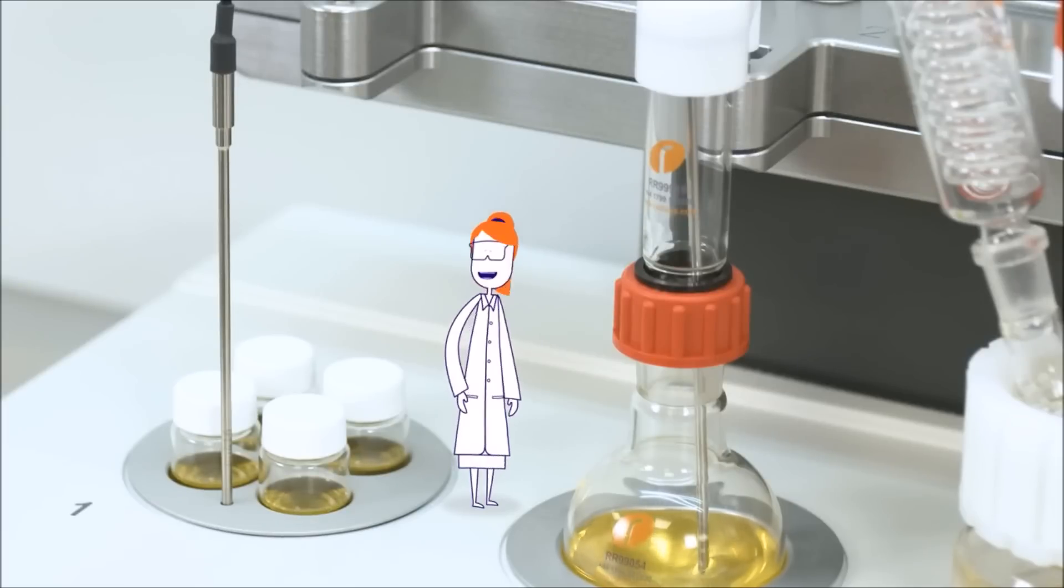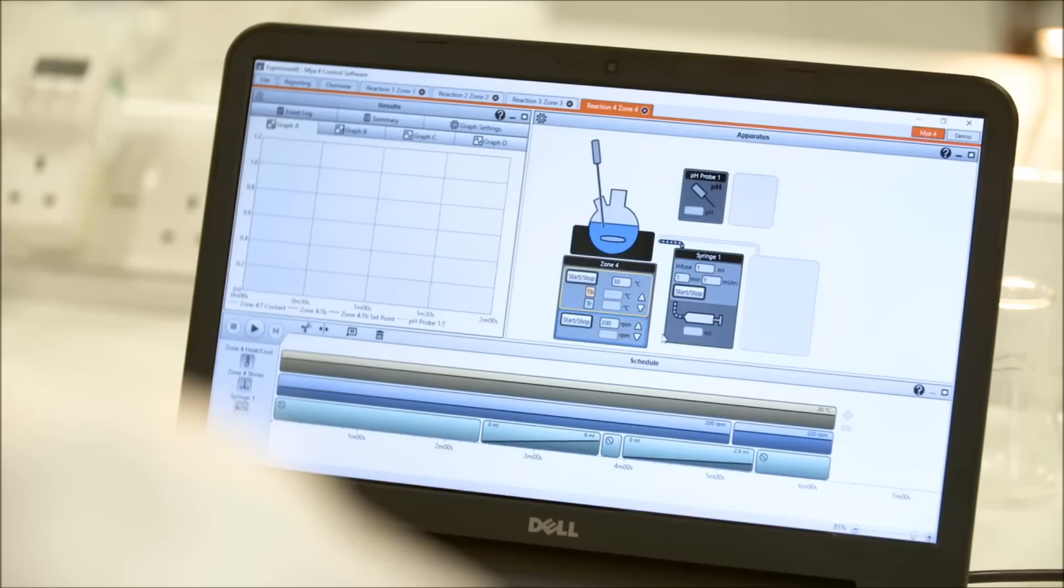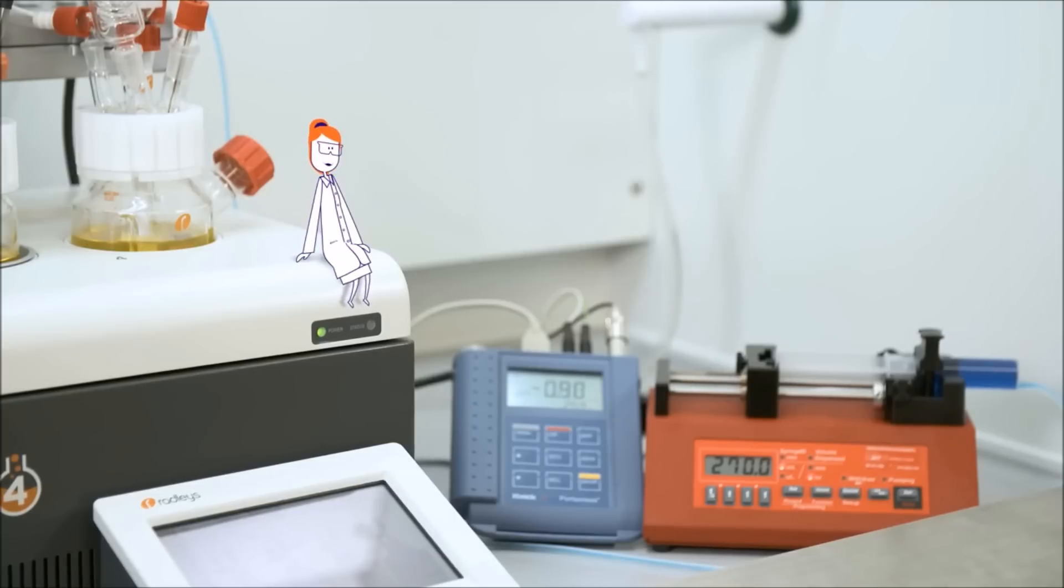And that's not all. By using the optional PC software, you can integrate and control third-party devices such as pumps, balances and pH sensors.